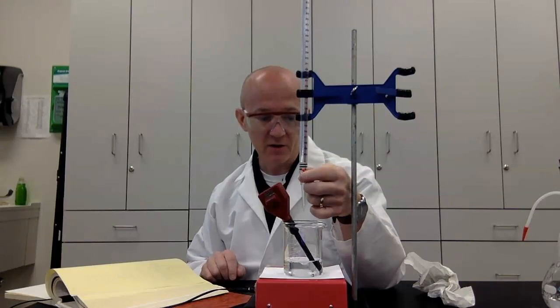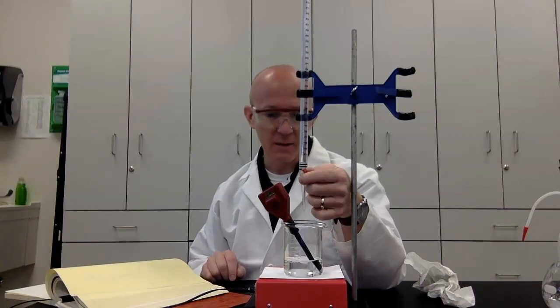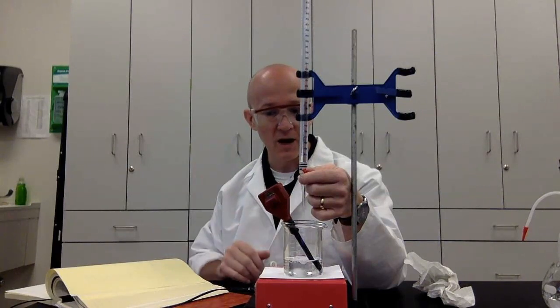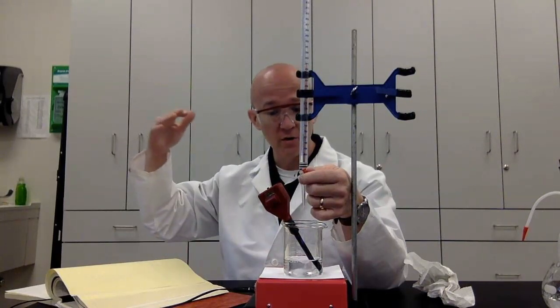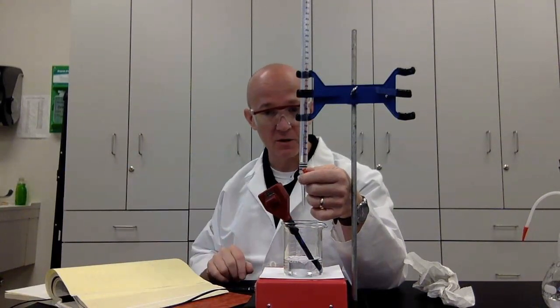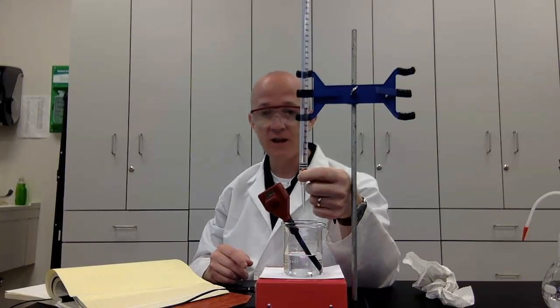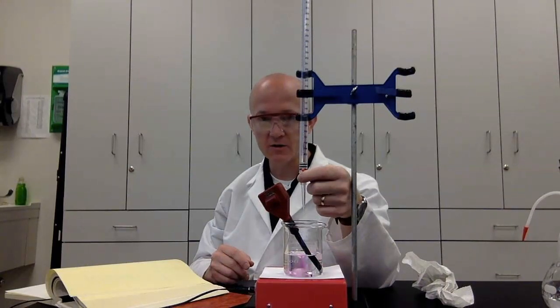There's the tiniest little bit of a color as these drops of the base are added in, you can see it. And I'm also looking at my pH meter, and I can see my pH meter increasing in pH, which means I'm going more and more toward the basic zone of pH. You see that little bit of color happening there? What we want is for that color to stay. We know that when the color stays, we've hit the point that we need to. Getting really close. You can see how it's staying a little longer.